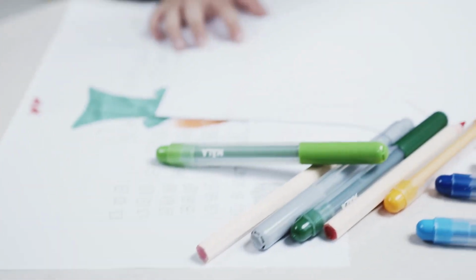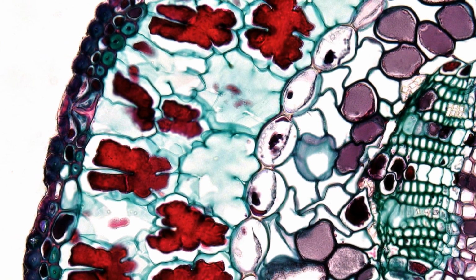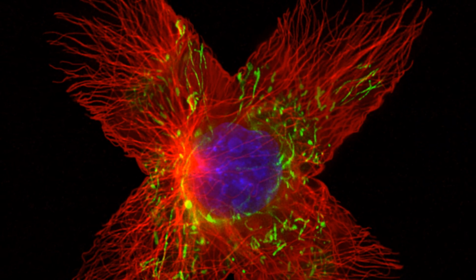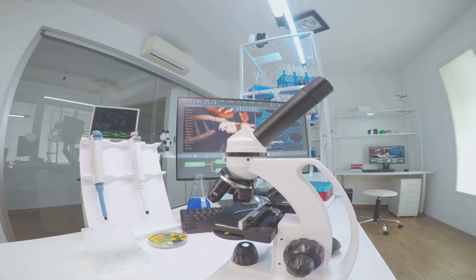The fluorescent dyes used in FIA come in a rainbow of colors, each emitting light of a specific wavelength when excited by a laser. This allows researchers to simultaneously track multiple targets within a single sample, painting intricate pictures of cellular architecture and function.